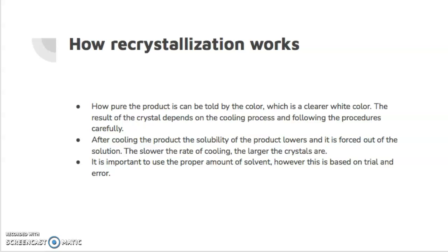After cooling the product, the solubility of the product lowers and it is forced out of the solution. The slower the rate of cooling, the larger the crystals will be, and it is important to use the proper amount of solvent, but this is just trial and error, so it's just experimental.